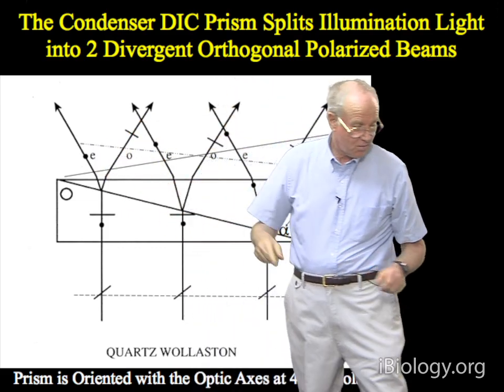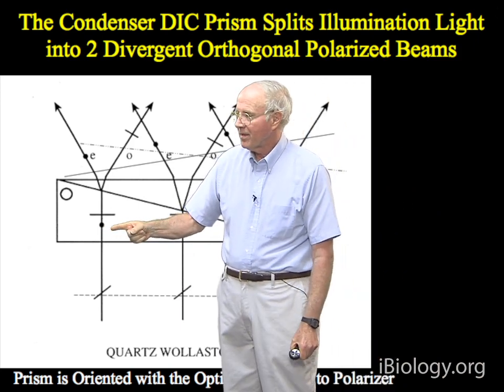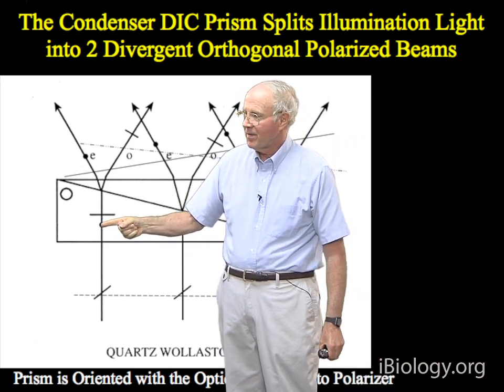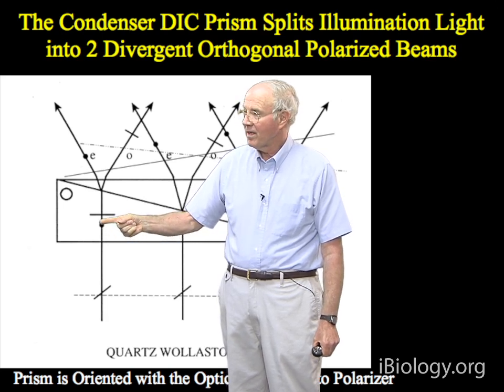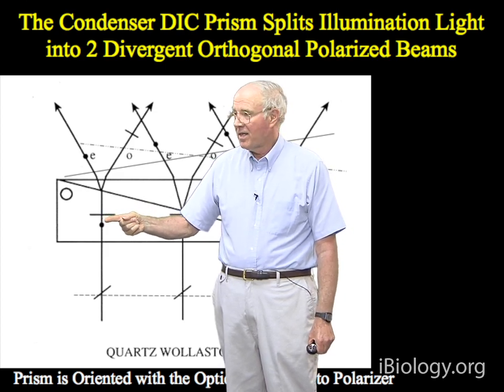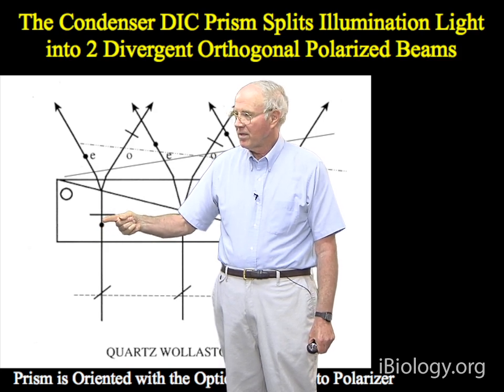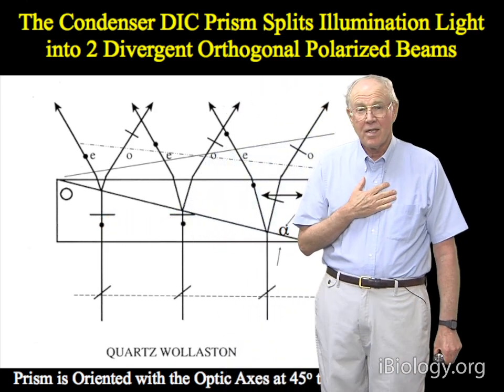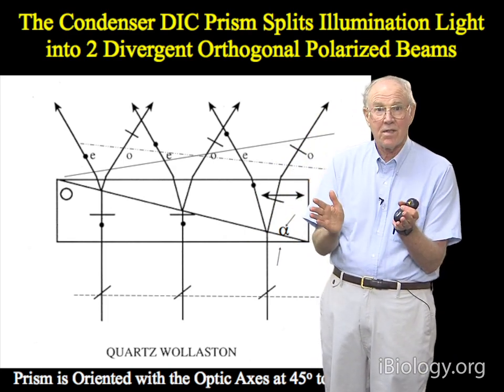And I've shown that in the drawing here by this dot, which is the wave that's vibrating into the board, and it's going slower compared to the wave that's vibrating perpendicular to that. These two vibrations are orthogonal to each other, and electric fields that are orthogonal to each other cannot interfere.